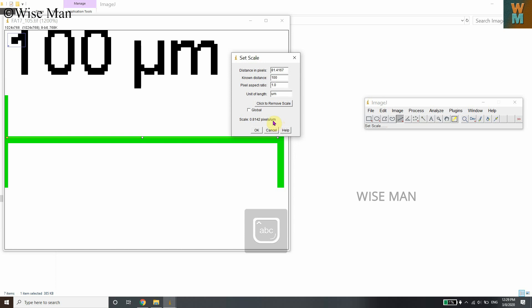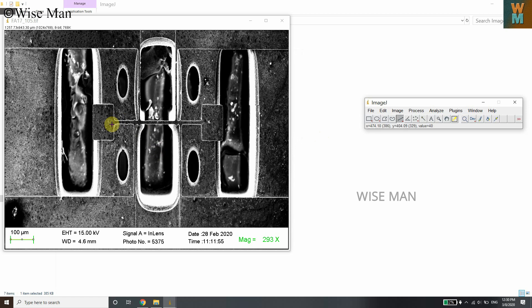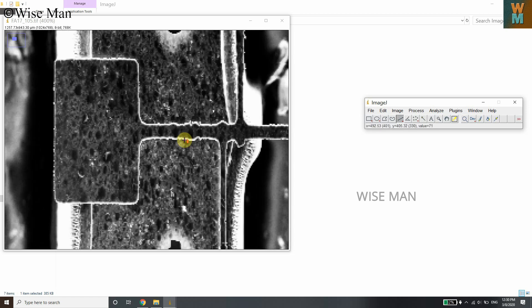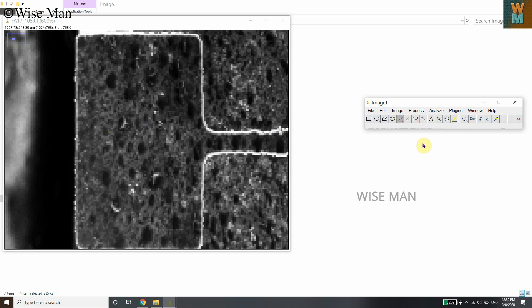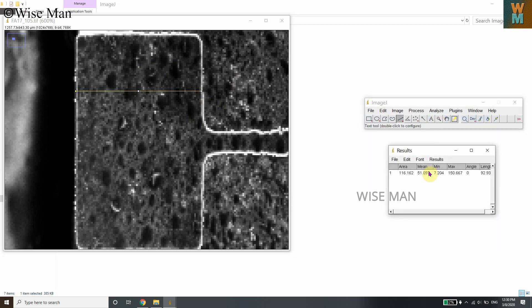In the Set Scale dialog, enter the known distance as 100 and the unit as 'um' (micrometer) — you can write it in lowercase. Then click OK. Now zoom in to the area you want to measure. Select the line tool, hold Shift, draw a line from one edge to the other, then go to Analyze and click Measure. The result shows a length of 92.938 micrometers.